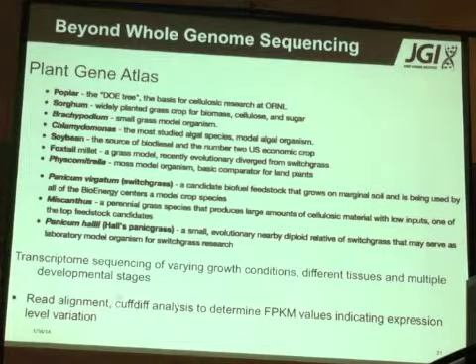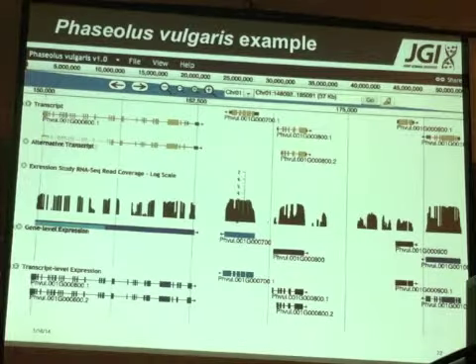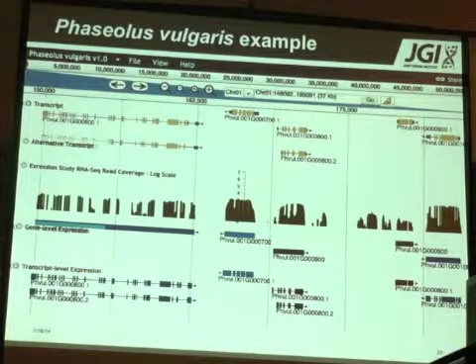And so the RNA-seq reads are then aligned and analyzed with Cufflinks to give us some FPKM values which indicate the expression level difference in that particular tissue or whatnot. So the example here, where there's this data already and in JBrowse, for me to demo a little bit here is in Phaseolus, which is the common bean. More interesting genomes where the black bean and the kidney bean are essentially the same species, just different cultivars.